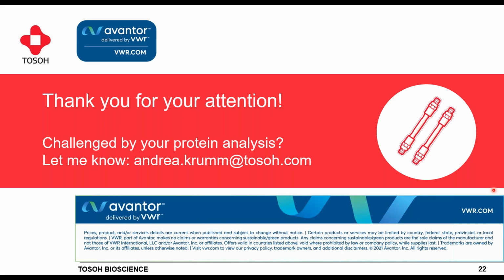Yes, I would say so. The very typical salt which is used is ammonium sulfate, and there we typically end up with 1 molar to 1.5 molar of ammonium sulfate. Of course, if you change the salt type, for instance, to sodium chloride, this is something we saw, then it increases. So for sodium chloride, it would probably be something like 3 molar you needed to add.